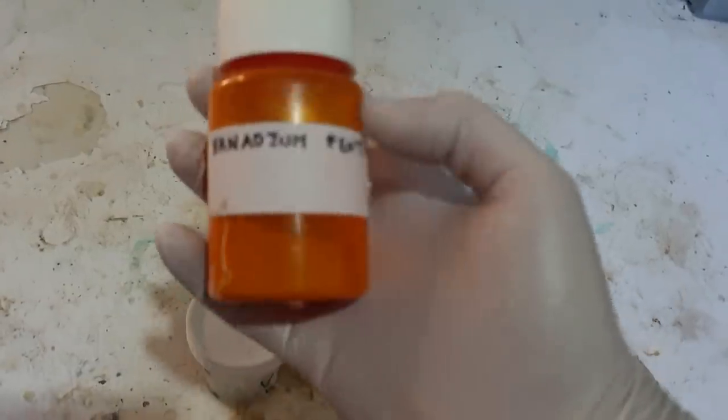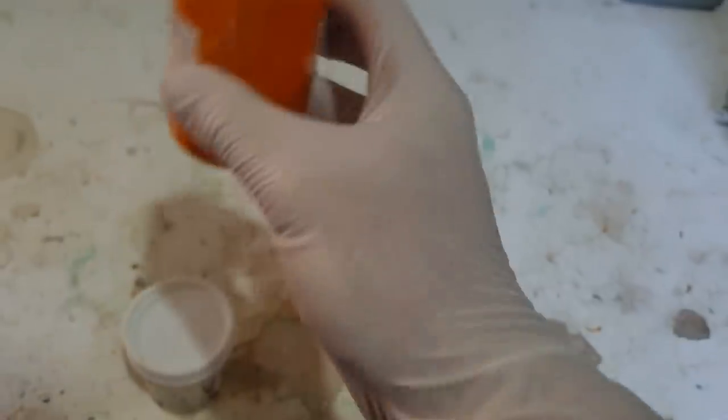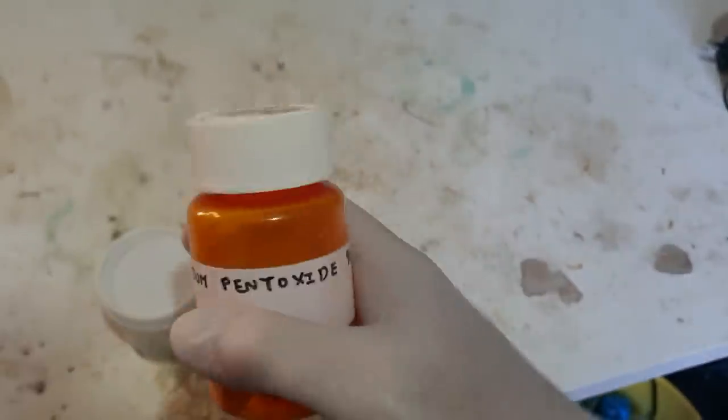I was given this in a Secret Santa for the Science Matters community a couple of years ago. I had 90 grams initially; I don't quite know how much is left — we're going to have to weigh that. Then we need to do a thermite that's controlled. The last one we did was completely out of control.